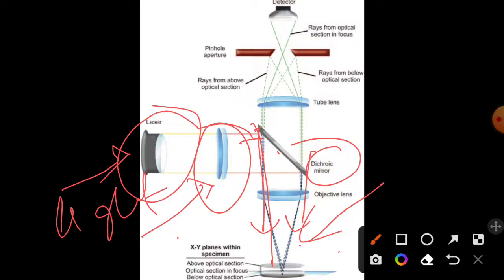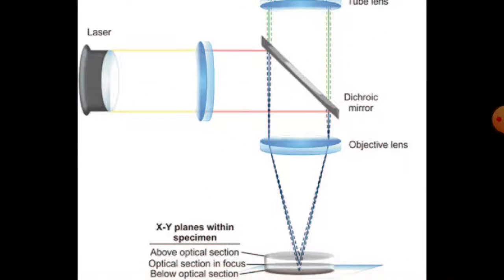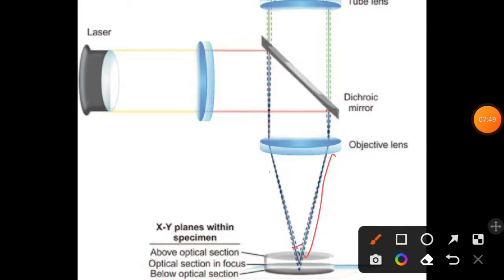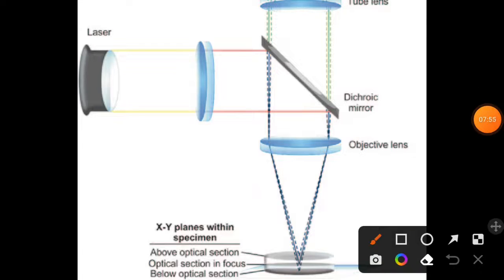Now, I have already discussed in our epifluorescence video that in the case of excitation light, the objective lens will act as a condenser, right? So it will condense the light towards the specimen, as you can see. Now the specimen will normally be illuminated.